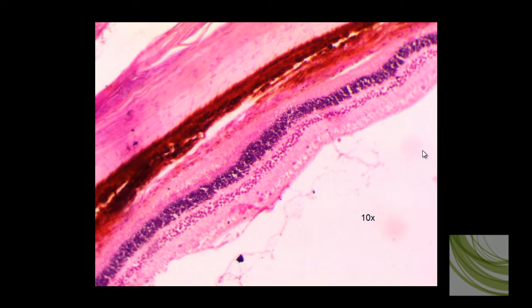Here I've increased the magnification to the 10x objective, and again we can see the sclera, the choroid with the pigment, and the retina. And we can see a lot more detail in the retina. We'll label the parts of the retina at the next microscopic level.